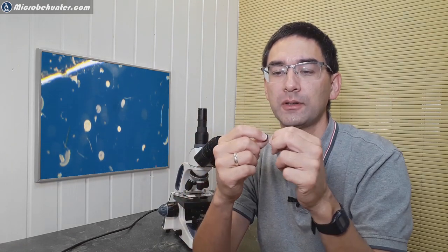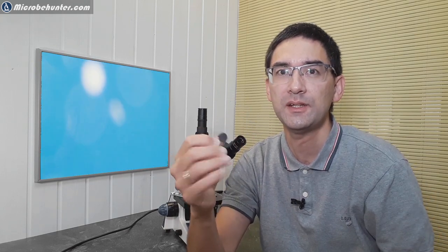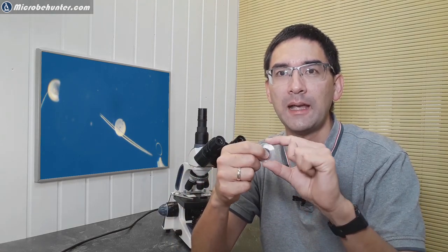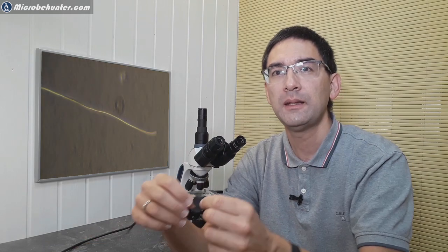And the inside diameter, this black disc, that is actually quite important. I did a test series. I made several of these filters using my 3D printer, and then I tested them out, and I found that the optimal diameter, at least for this microscope and also for other microscopes with a filter size like this, is 15 millimeters. Okay, 15 millimeters. If it's anything smaller, then the background will not be entirely dark. And if it's too big, then you're blocking out too much light and the whole image becomes too dark. So 15 millimeters seems to be the sweet spot here.